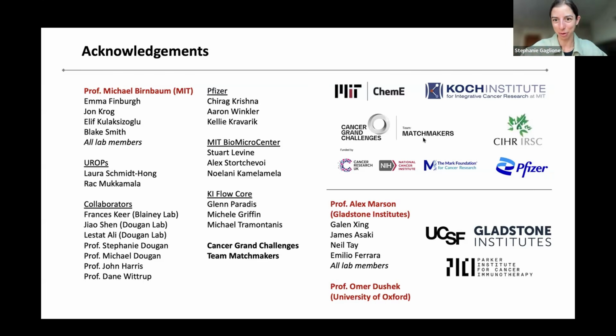I see the first question from Sharon, and yes, they're all published. I just put the two Addgene links in the chat. We put them up as both options: you can order all of the vectors in an array and make pools yourself if you want, or use them individually if you desire, and also already pre-pooled. And so we put sort of everything there with worksheets. Yeah, everything is there. And if you have any issues and you contact Addgene, they're going to send you to me. So I'm happy to help if you have any questions or issues with it. Velociraptor, yes, it's up as a preprint, but not quite in exactly the same depth. But yeah, always happy to chat about that.